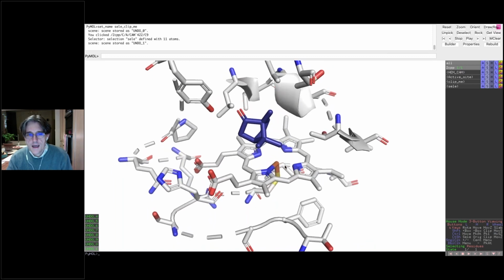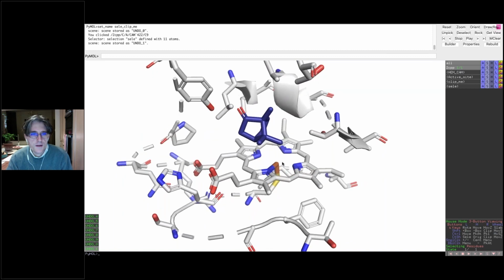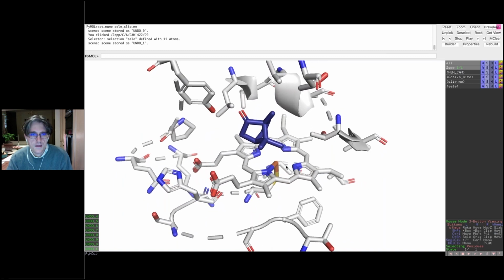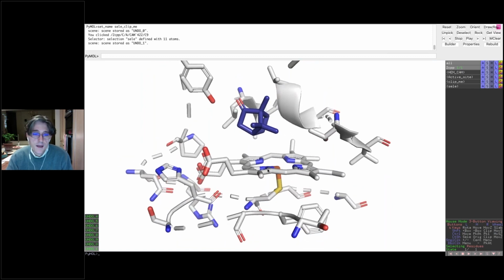I mean, it does take, I think, time to get familiar with the protein and the best angles. And there may well be conventions in the literature about how things are depicted as well that you might need to follow. Okay, we have another question.